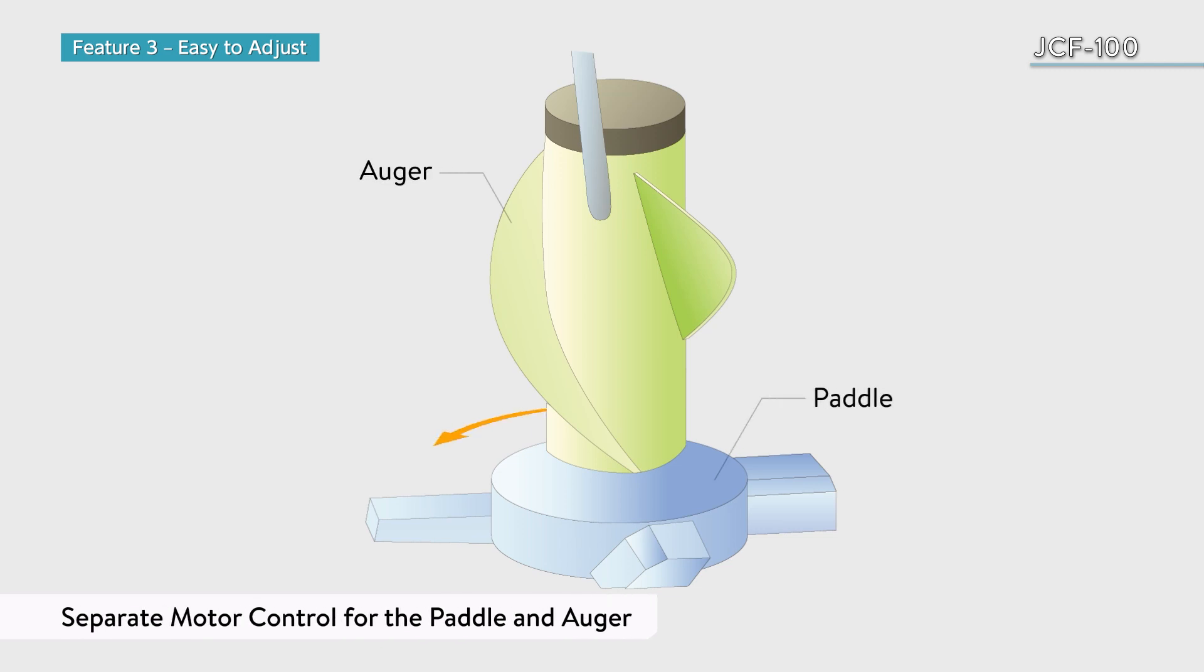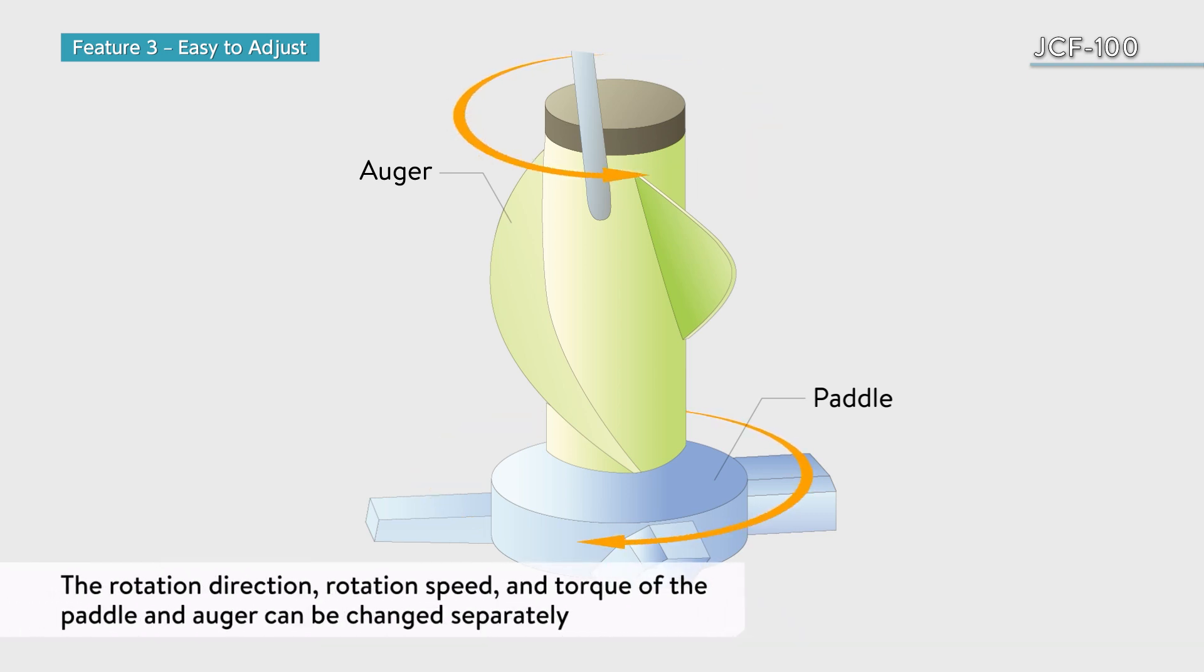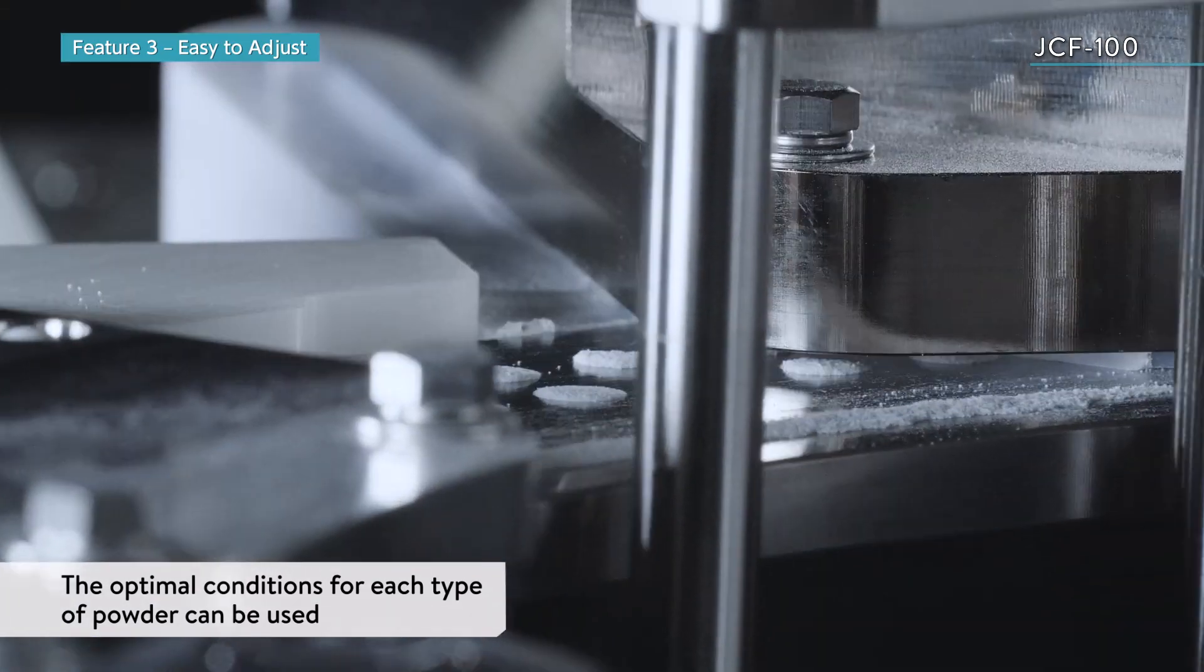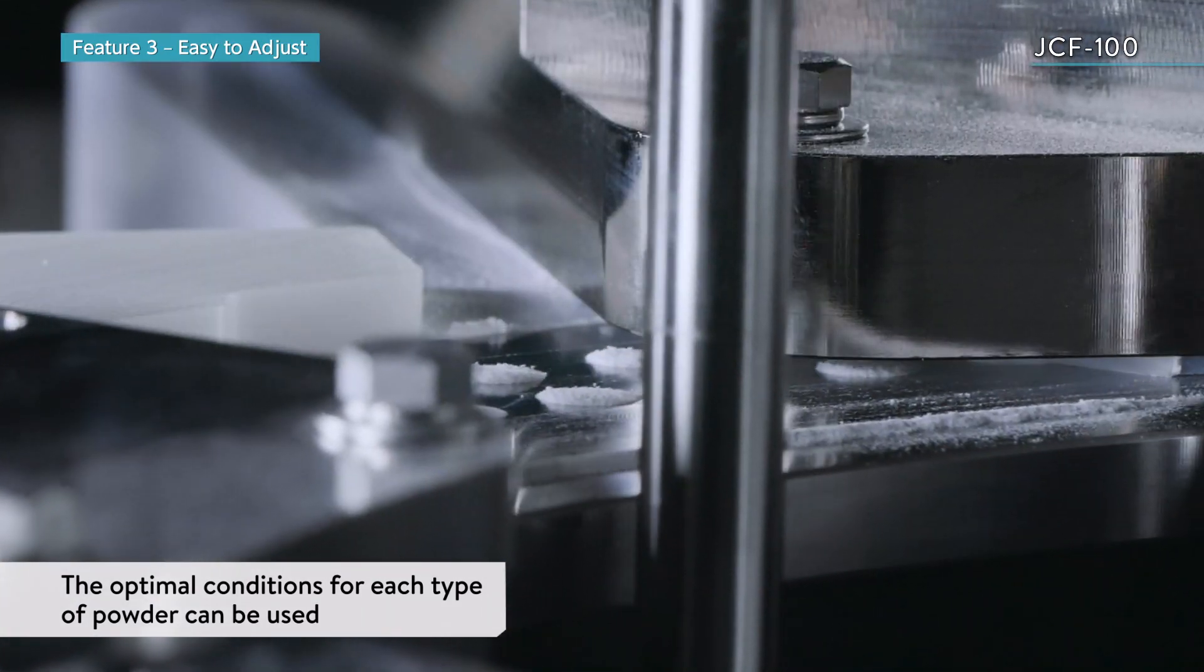In the filling area, the paddle and the auger are controlled by separate motors. Therefore, the rotation direction, rotation speed, and torque of the paddle and auger can be changed separately, making it possible to fill each type of powder under its optimal conditions.